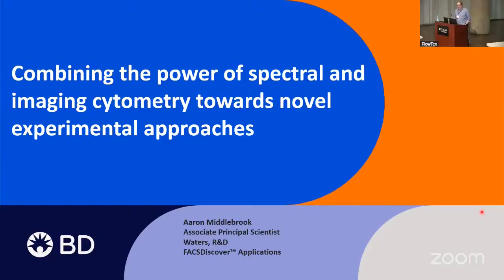So today I thought I'd talk about combining spectral and imaging together, just because I feel like that's one of the real strong suits of our platform, that we have the ability to look at both kinds of experiments within the context of imaging or spectral. This is actually data that I covered in a webinar, but it's such a tremendous amount of data that I really had to gloss over.